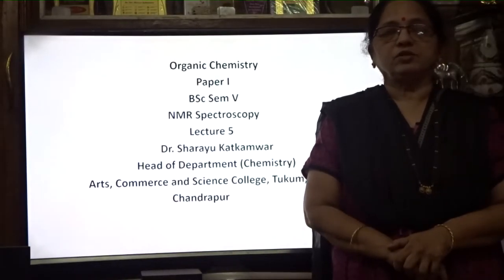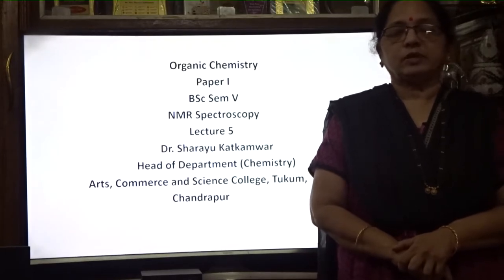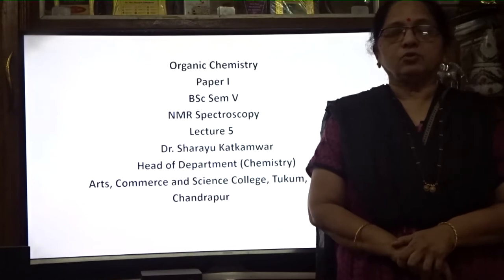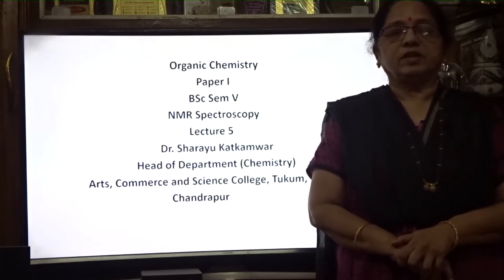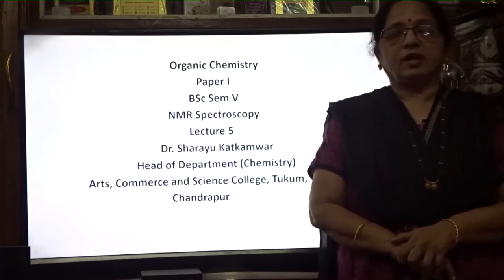Good morning, students. Today we will study the solvent used in NMR spectroscopy. Solvent means the solute should be completely soluble in the liquid. If it is completely soluble, then it is known as a solvent. So, what is the solvent used in NMR spectroscopy?